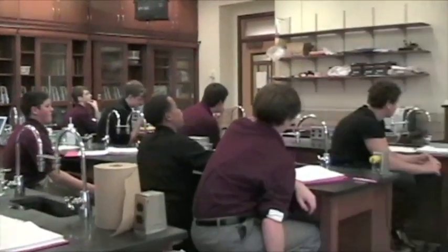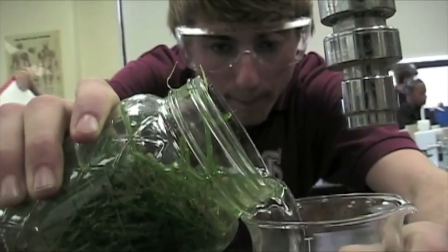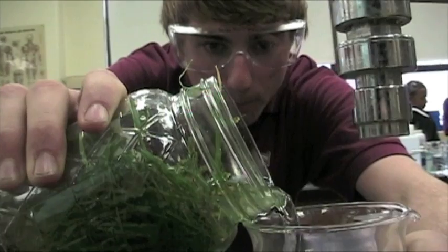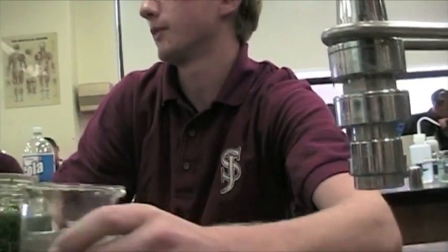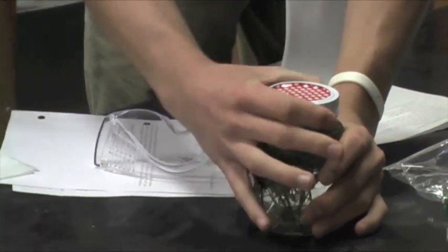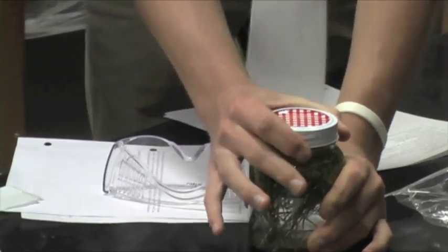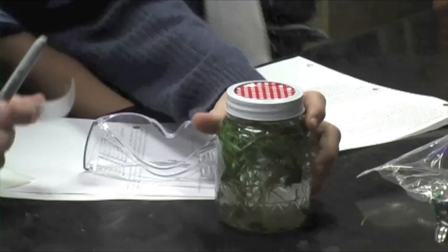In this exhibit, students were given a case study involving a polluted lake and are charged with the responsibility of determining what factors lead to lower dissolved oxygen levels in that lake. Students are guided with a laboratory experiment where they test the dissolved oxygen content of 3 different water samples. Students began their work by placing grass in a container of water and sealing the sample for 5 days to simulate runoff water.